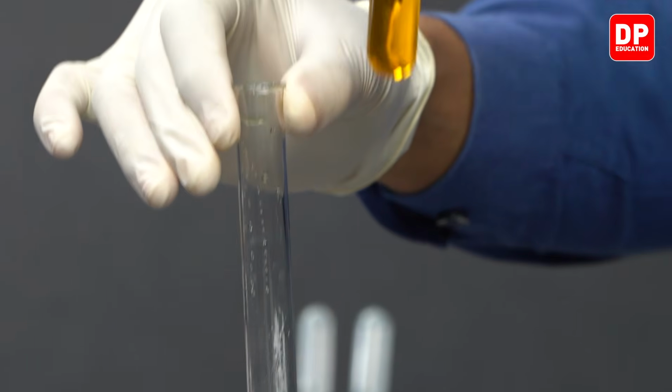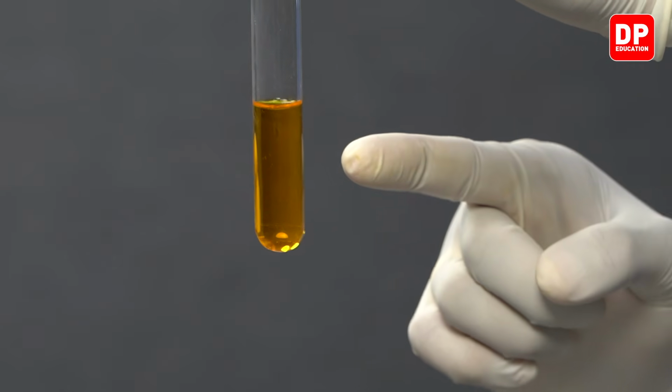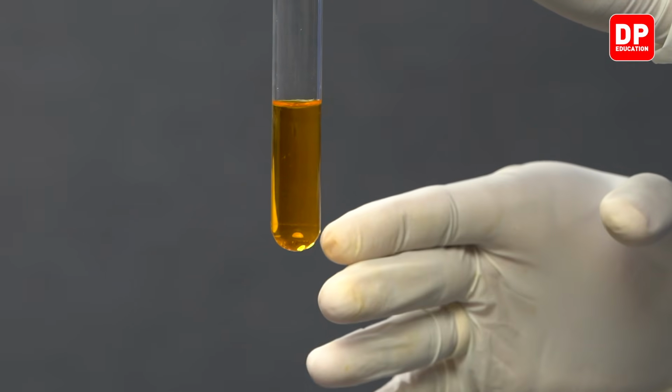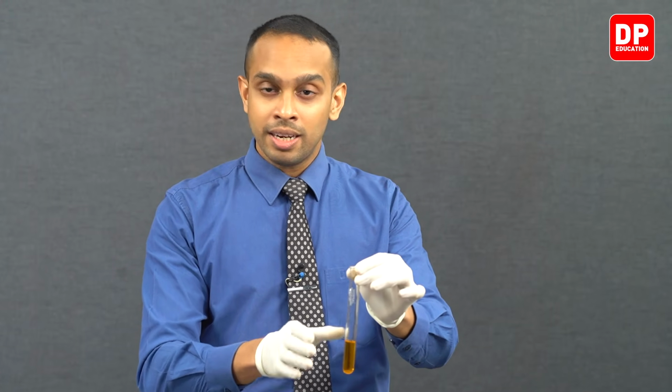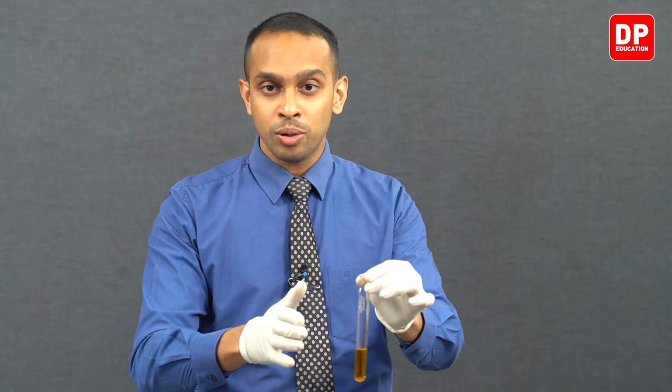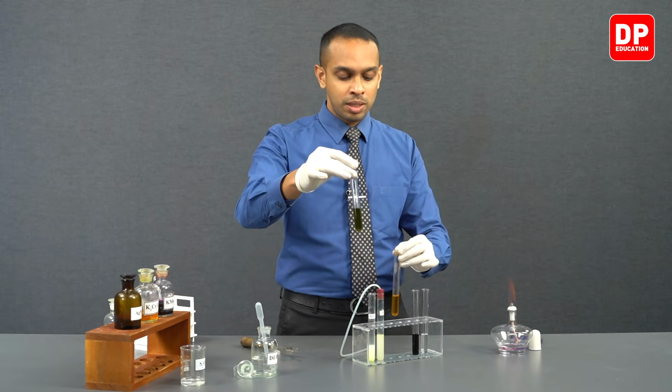The orange color is due to the presence of dichromate ions. And as the dichromate ions undergo reduction, they turn into chromium 3+ ions. Chromium 3+ ions in aqueous medium appear green in color.